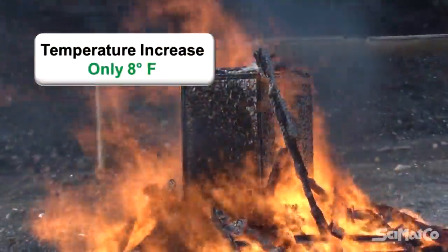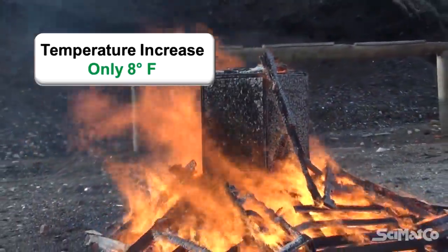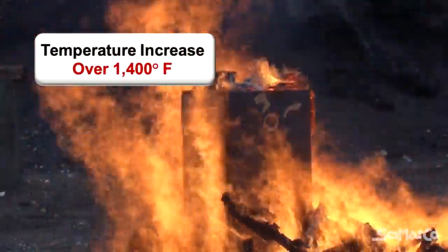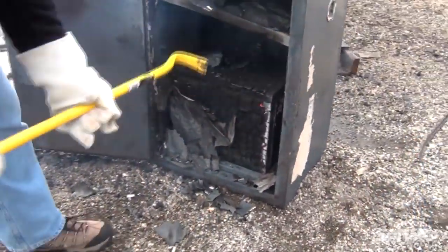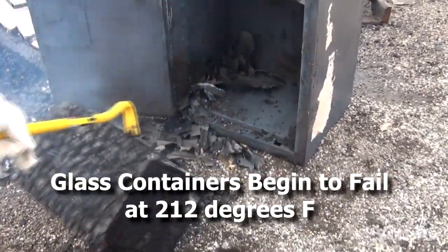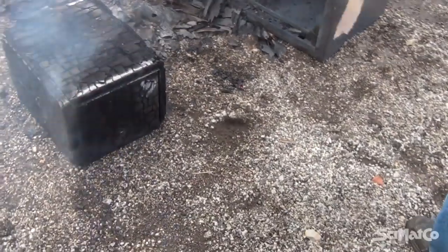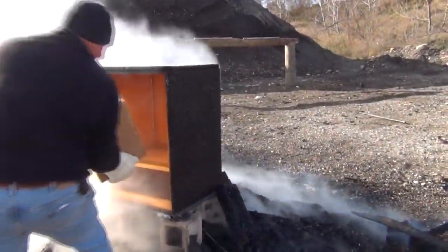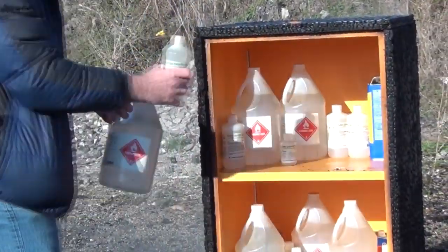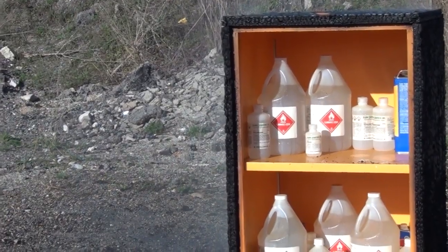The temperature inside the Cymaco wooden flammables cabinet only increased 8 degrees in our 12-minute test, while the temperature inside the metal cabinet increased over 1,400 degrees. The temperature sensor box removed from the metal flammable storage cabinet was fully burnt and completely destroyed. We recovered a fully functional sensor box from the wooden Cymaco flammables cabinet and safely removed all of the flammable chemical bottles, which were cool to the touch.